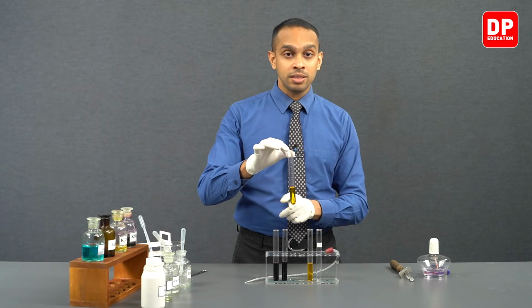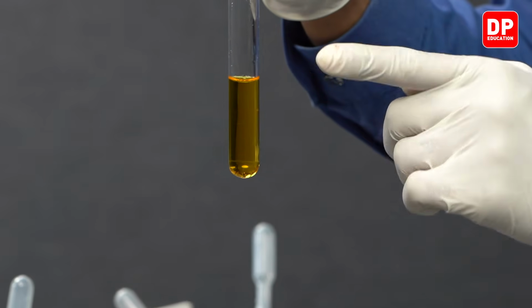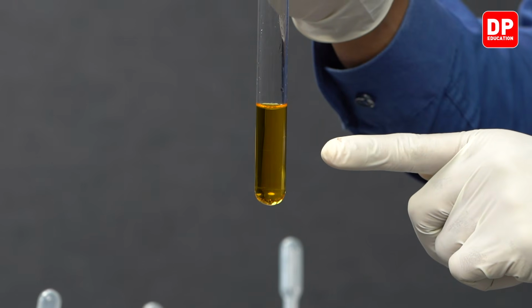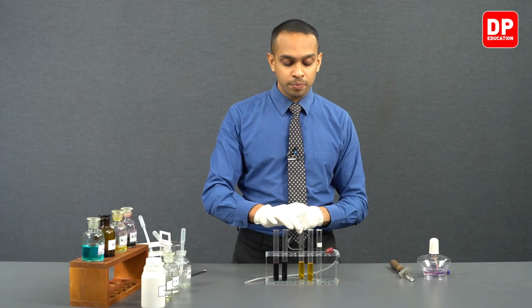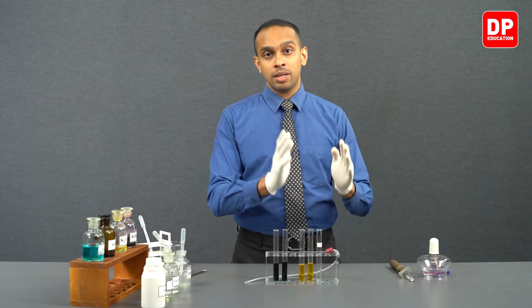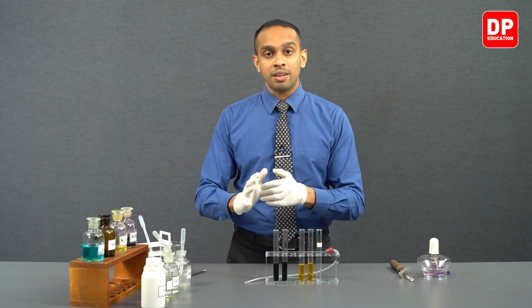We have 2 vials to keep one as a control. So we have acidified potassium dichromate here. We observe the color of the acidified potassium dichromate, which is orange. So if we send hydrogen sulfide through it, you will observe the color of this acidified potassium dichromate changes from orange to a green color.